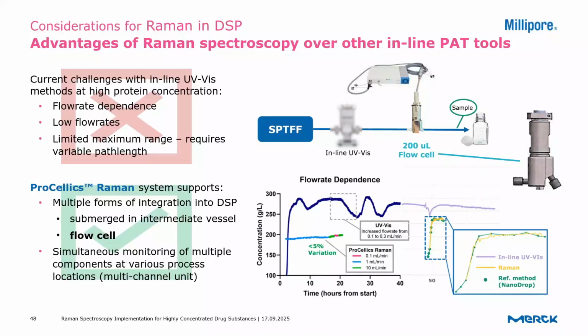The main driving factor for developing this high protein concentration use case for Raman was to address our team's internal challenges, which have also been similarly noted by customers. In the past, our team attempted to monitor protein concentration in a highly concentrated, purified process stream exiting a single pass TFF system as the final downstream step. This process can concentrate protein samples beyond 250 grams per liter.